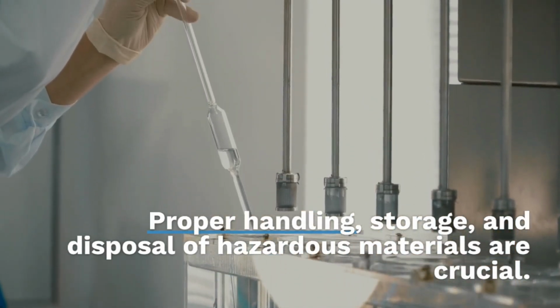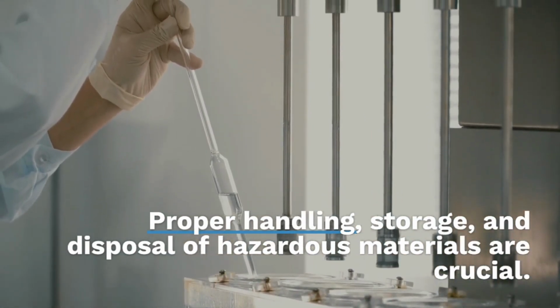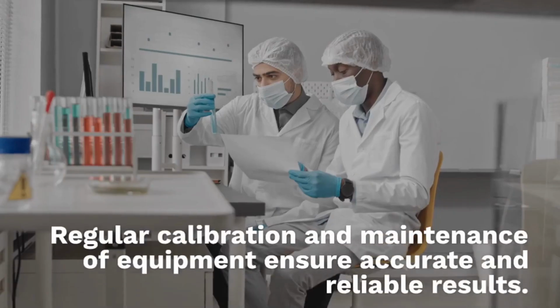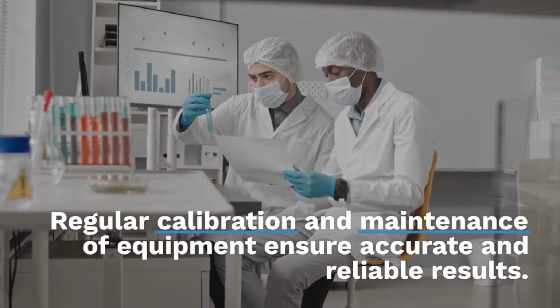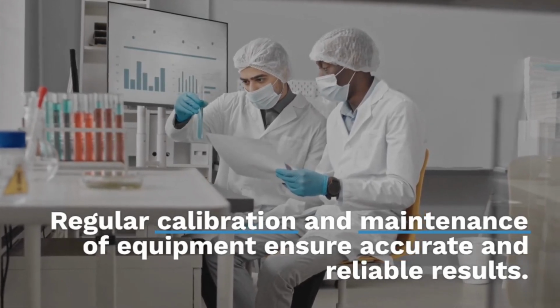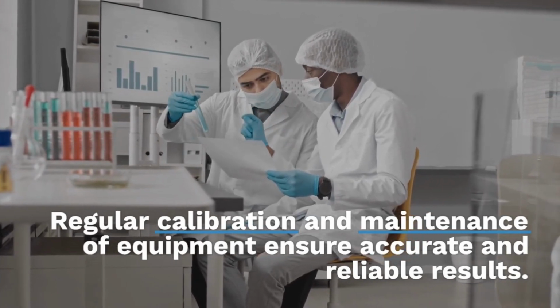4. Calibration and maintenance of equipment. Regular calibration and maintenance of laboratory equipment, such as balances, pipettes, spectrophotometers, and centrifuges, are essential to ensure accurate and reliable results. Equipment should be properly maintained, calibrated, and validated according to established procedures.